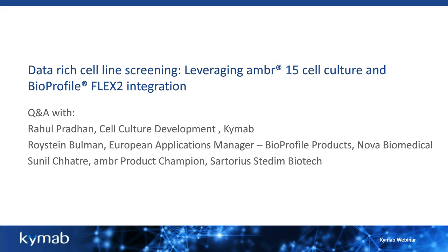Thank you. And we have a question about the sample volume. What sample volume are you acquiring from the ambr system? Anything between 400 to 450 microliters. Maybe I can comment on that. So there's 3 settings that are available on the system. It can be set to 400 microliters, 450 and 500. I assume you have it set to 450.